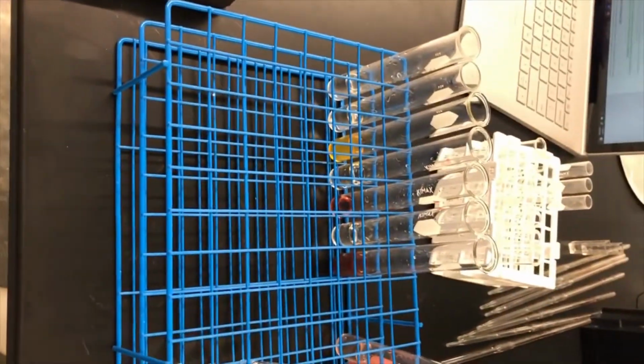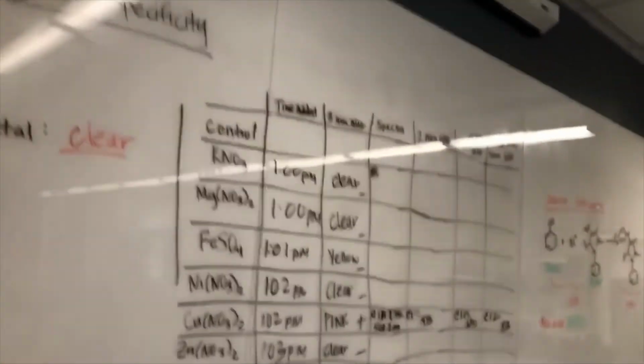So now 10 minutes later, since they've been mixed, it is now this, sorry, my phone started to die, so I had to hit a button. Anyway, so over about 10 minutes, it turned this burgundy color. Okay, so that's part one, where we're just observing what happens with these different metals.